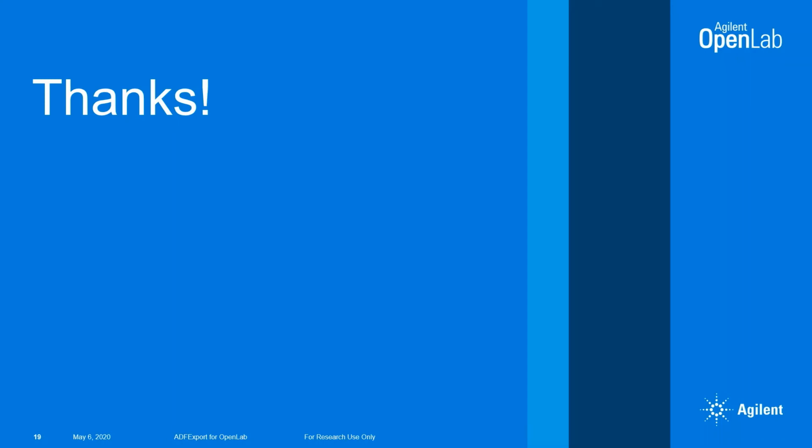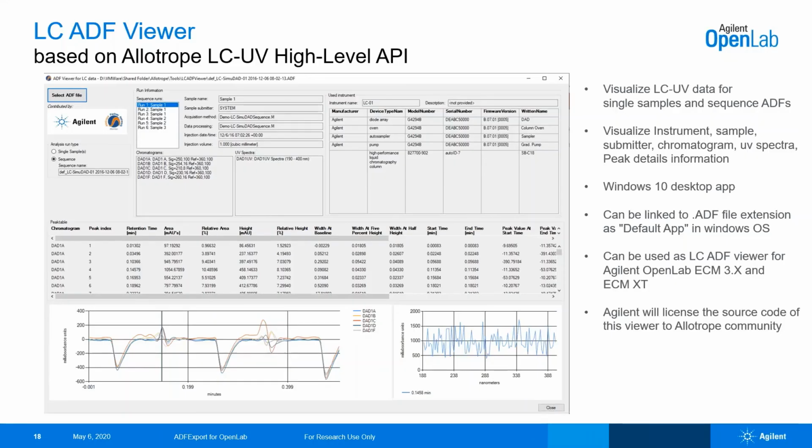Yeah, so it reads out the information from both worlds. The metadata is read out from the data description, but the raw data you have seen in the UI is read from the data cube. So the lower part of the UI comes directly from the data cube and uses the data cube API to read out the raw data, and the upper part of the screen is reading out information from the data description, and this data is read through SPARQL queries. And the data package section is not used in that case.